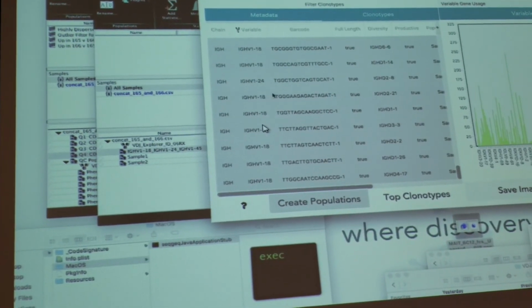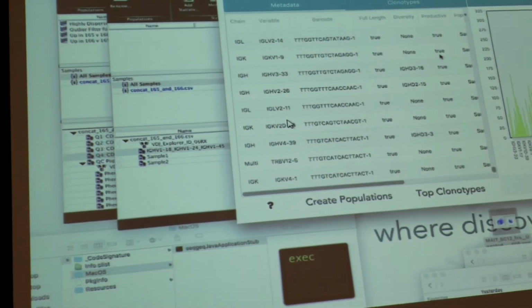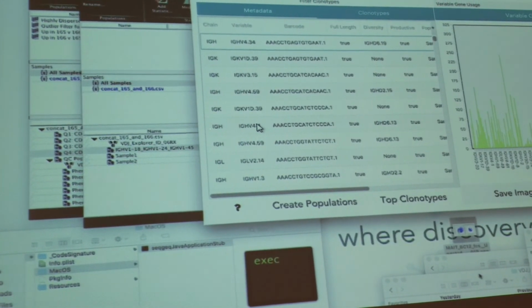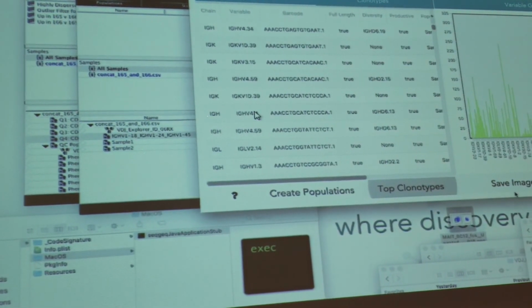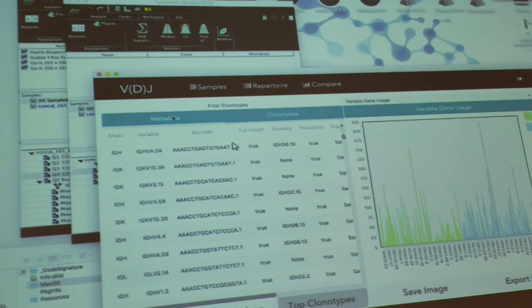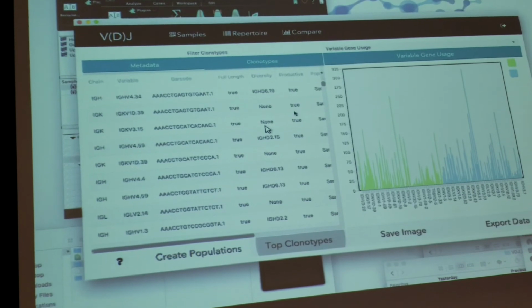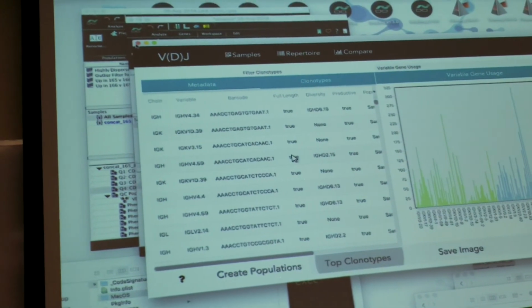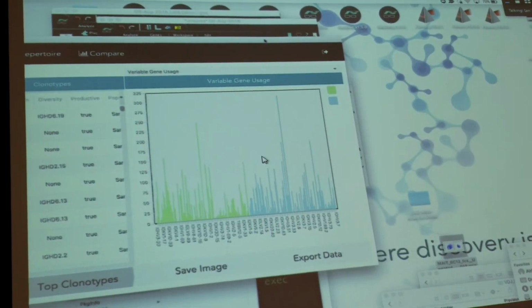Another cool trick here, let me try and remove this filter if I can. We should be back to our total set of all rows. And if I just want the most frequent clonotypes, I should be able to right-click here. Oh, that broke. I should be able to enter the number of top clonotypes that I wanted to generate. So I'll get populations based on the different heavy and light chain pairs, and it should give me back the amino acid sequences corresponding to each of those chains.